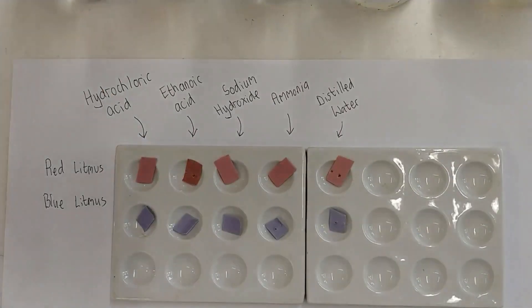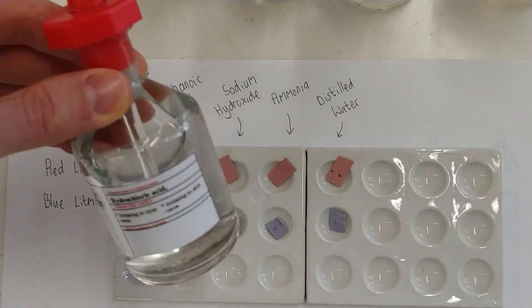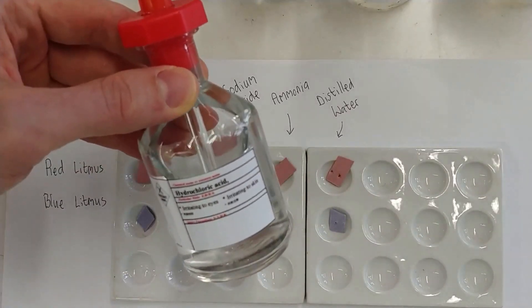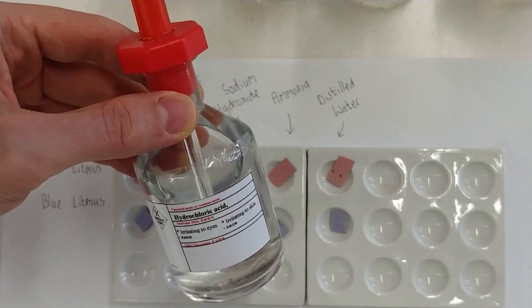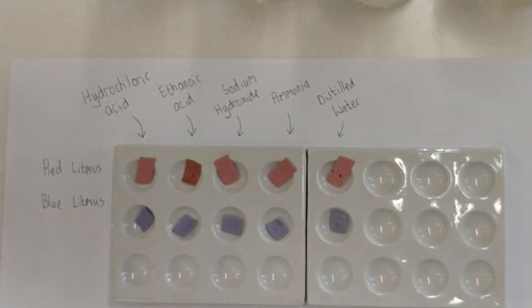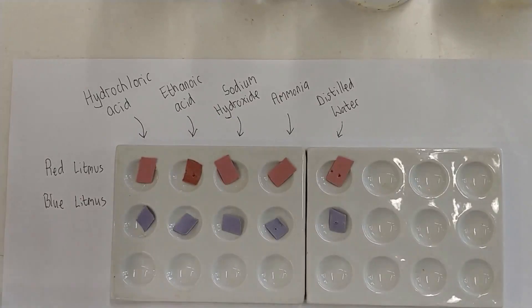Well, that's that. So let's take the hydrochloric acid and we'll use the dropper, dilute hydrochloric acid, I might say, and we'll use the dropper to drop it onto the red litmus paper first.